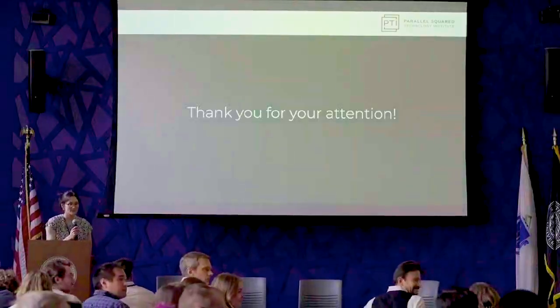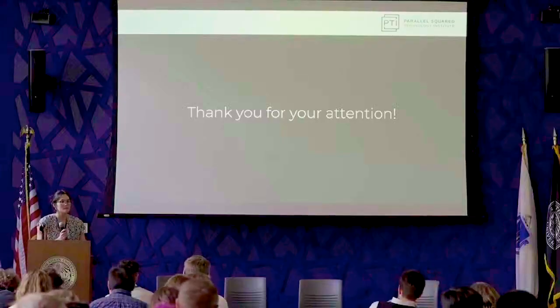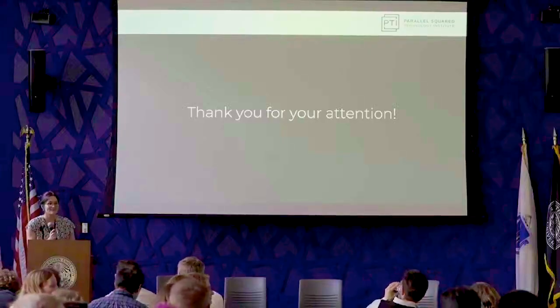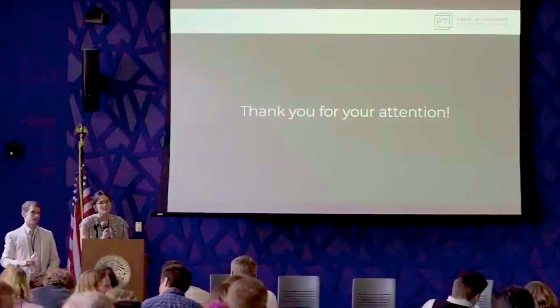Hi, great talk, guys. The potential to screen tens of thousands of small molecules for tags in the future is really exciting. Do you have any plans, instead of just the high throughput approach alone, to maybe train a model on the chemical structures for your desired quantities, like the lack of retention time shift or fragment quality, in addition to the high throughput method, to have an intelligent design strategy?